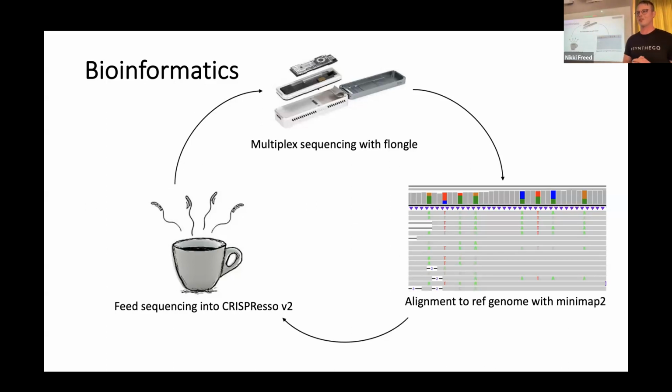Something else here is that if you're really cost savings focused like us, if we're sequencing amplicons from a different point in the genome, we can just chuck a whole bunch of amplicons in the same barcode, do one barcoding reaction, and just separate the amplicons bioinformatically. So that saves costs even more, because when you're using the Flongle platform, the enzymes to do your prep is actually the more expensive part.